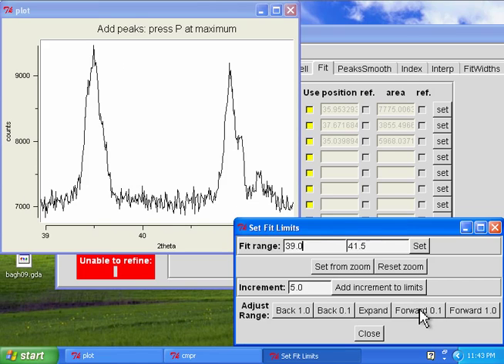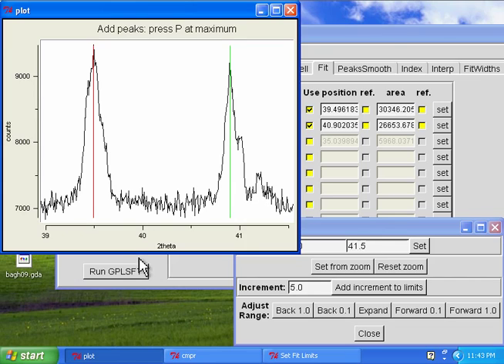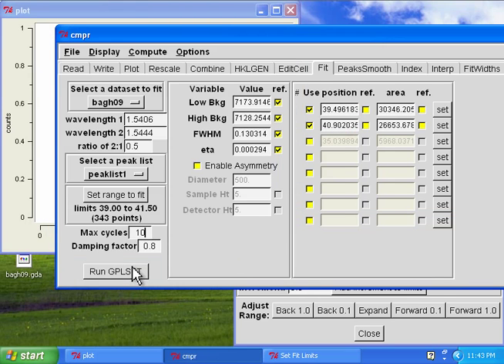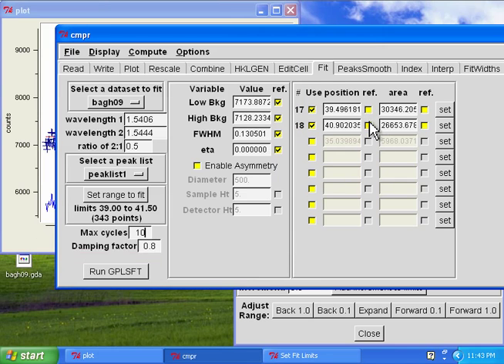If we do that, we get 2 peaks, maybe 3 in. So that one looks a little narrow. Boy, I don't like including that one. So we'll just include these 2 bigger ones. Peak and peak. And we'll run this. And okay. No, oh, I'm not refining these. So let's refine that.